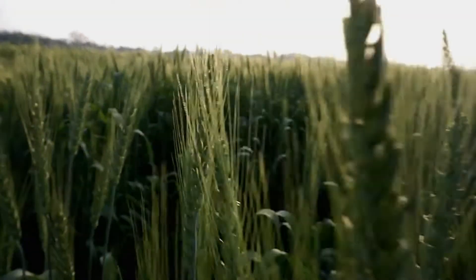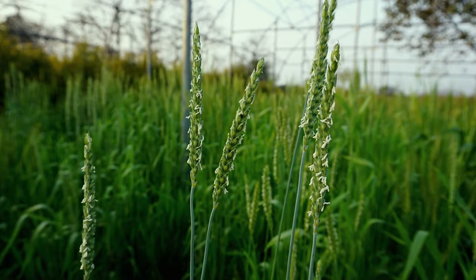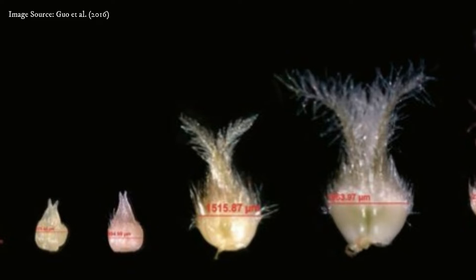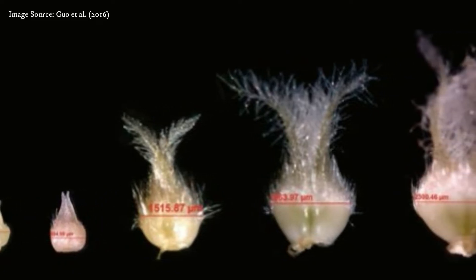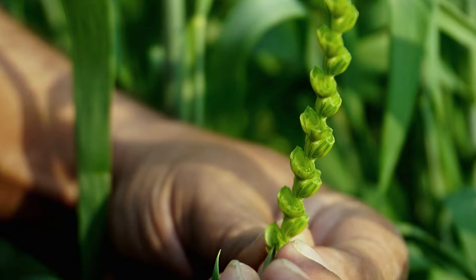Wheat is a highly self-pollinated crop. The floral part of wheat is known as a spike. Each spike consists of two rows of spikelet, and each spikelet contains three florets. In each floret there is an ovary that can be identified with its white flask shape structure, and three anthers which look filamentous and are green in color.